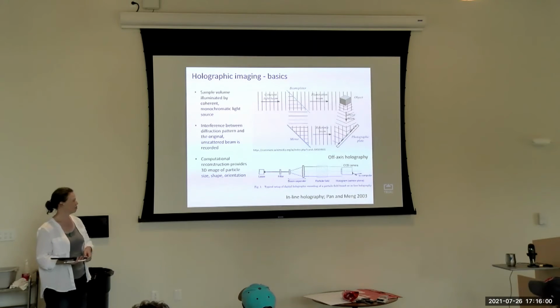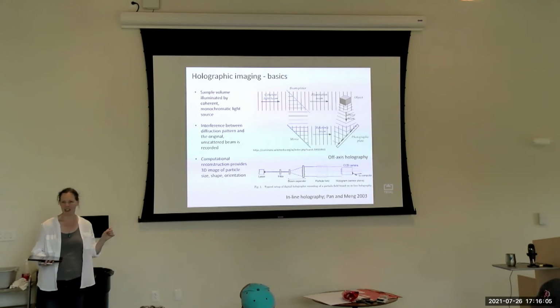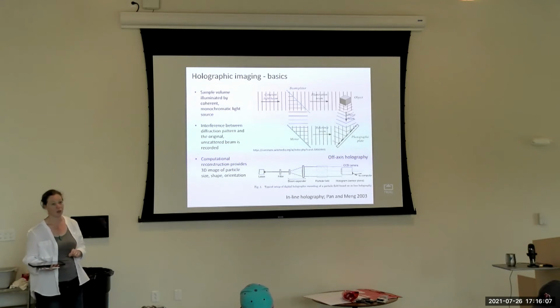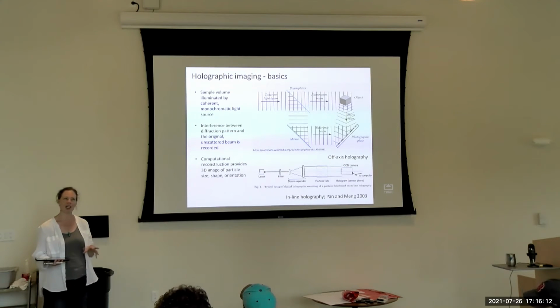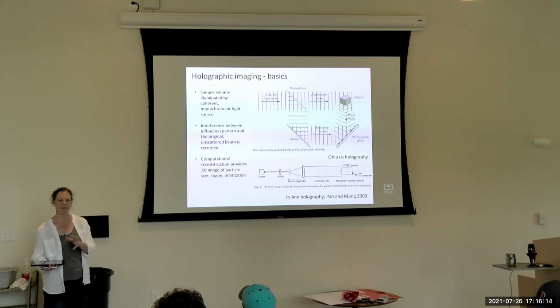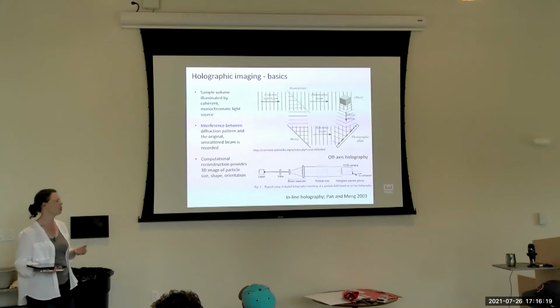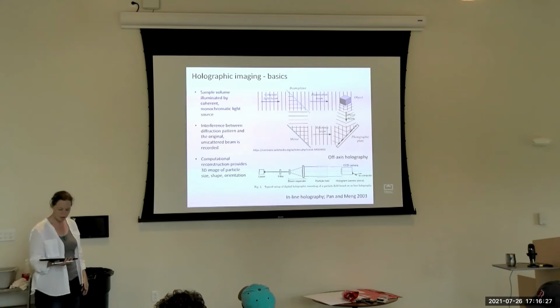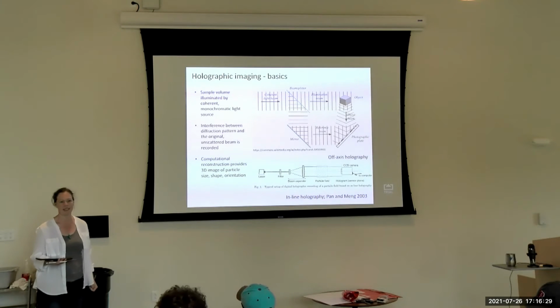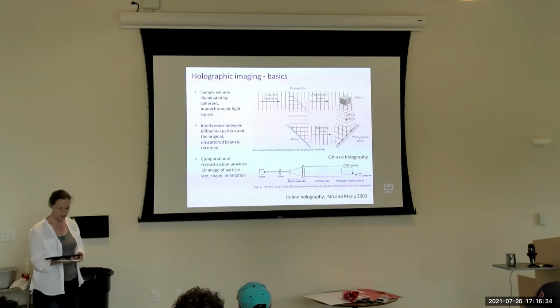So I mentioned a couple slides back before lunch that we would also talk about holographic imaging and line scanning cameras as 2 other types of imaging systems that are in maybe less common use, although line scanning has become important as people start to think about larger particles and higher levels in larger organisms. Holographic imaging is a technology that's been around for a really long time, but only in the last decade started taking off, for instance, in marine work, commercial instruments.